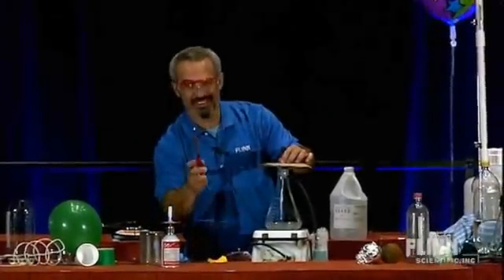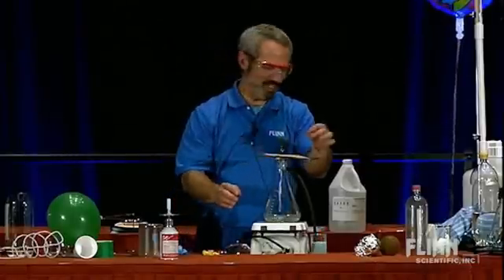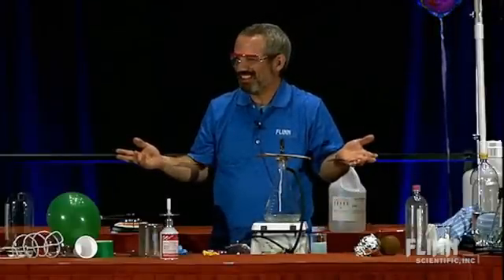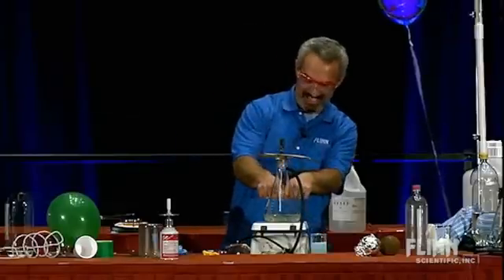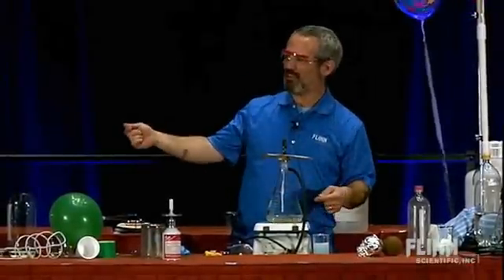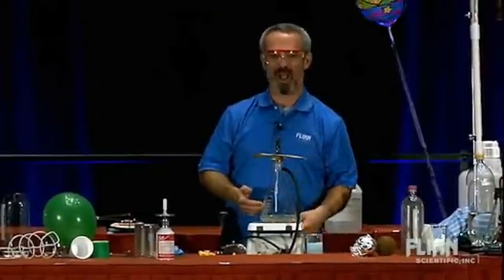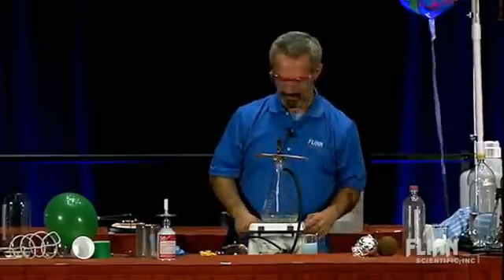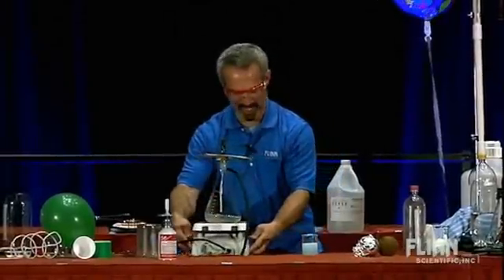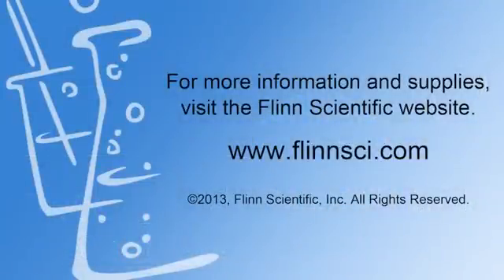Bubbles of what? Hydrogen. Think about it — if you steal the oxygen away from water, what's left? Hydrogen. I love that demonstration. There's the magnesium oxide. It burned more vigorously in here than out in the air, because not only is there more oxygen, but it's hotter — higher temperature in there. And the byproduct coming off is hydrogen, which you can capture in some soapy water. I'm glad I was able to redo that one after we ran the flask dry.